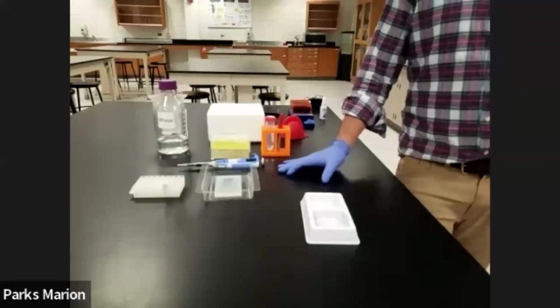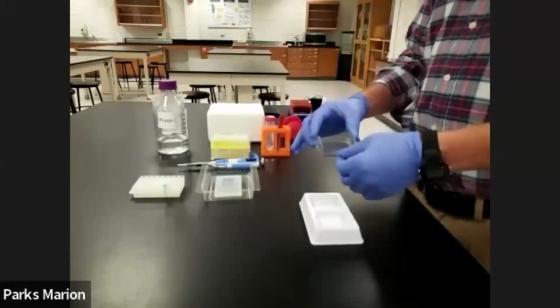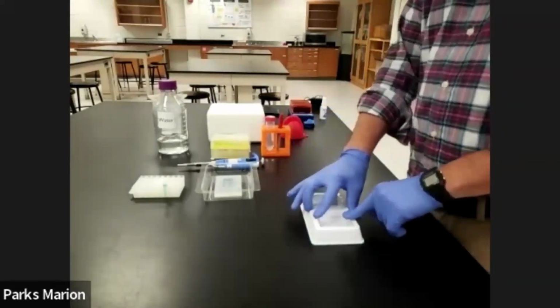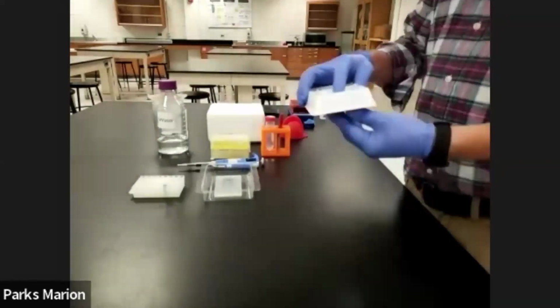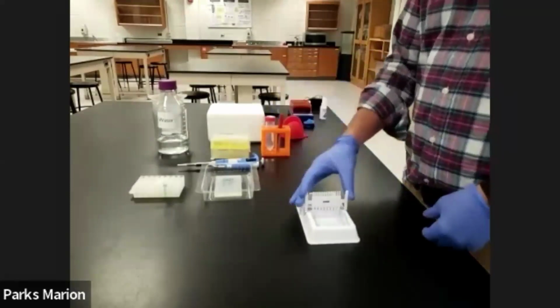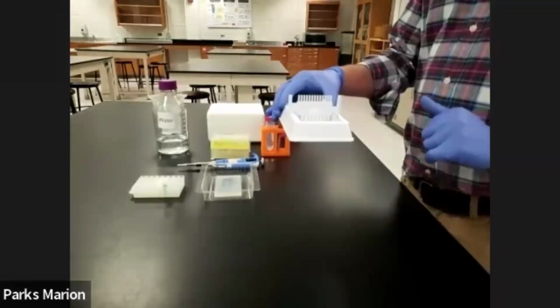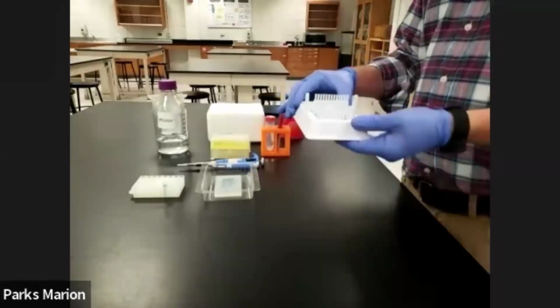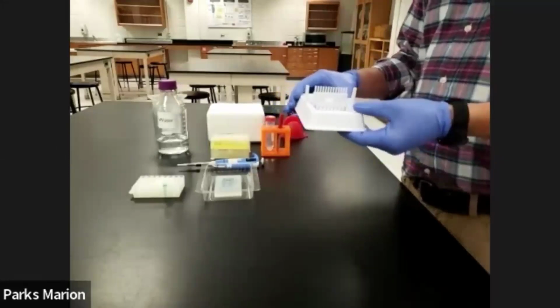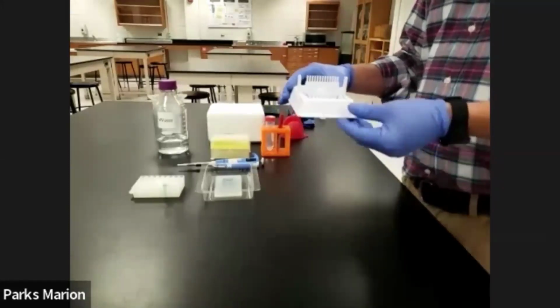To get started, we need to prepare our gel. Our gel is created in this casting tray, which, in order to give it form while it's liquid, we set into this mold. Once in the mold, we need to add a comb to allow for the gel to form around those comb teeth and create what we call wells, which are spaces where we will insert our PCR products before running our gels in the electrophoresis machine.